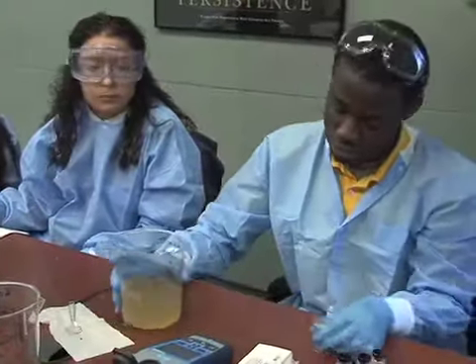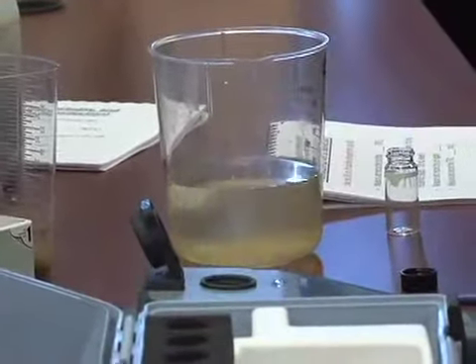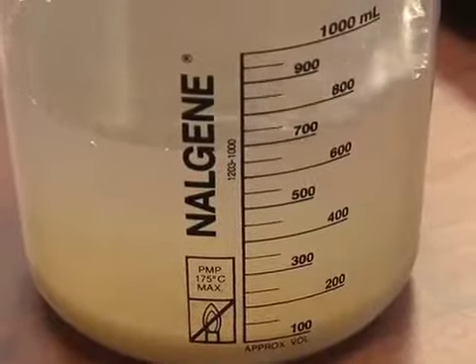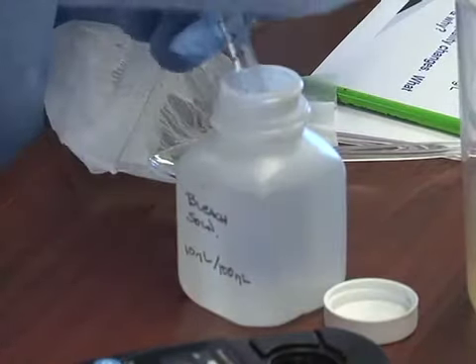So we learned how to measure the pH, the turbidity, and the TRC of the water solutions that come through the filtration plant. And to learn about nature, how water is recycled or how water is processed, they really have to get the hands-on experience. And then I think it's a good experience for them to come and see what scientists are doing here and how we pollute water, and then how we can reduce or minimize the use of water and how to conserve it.